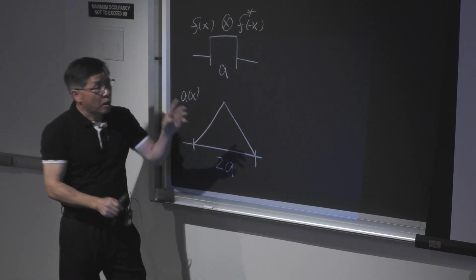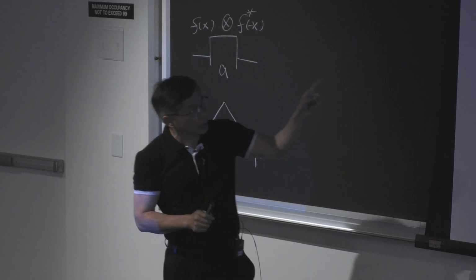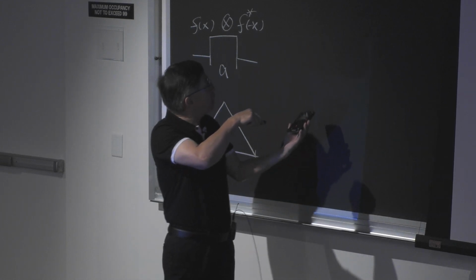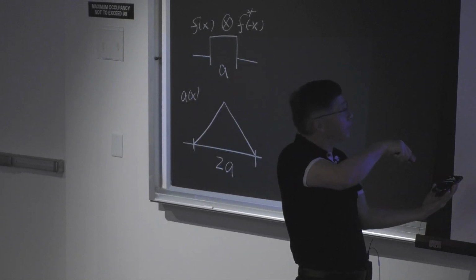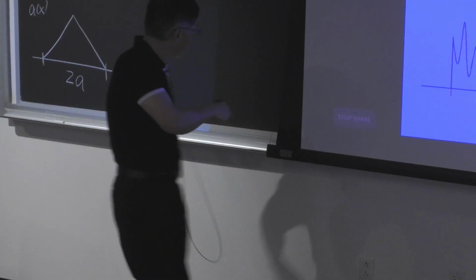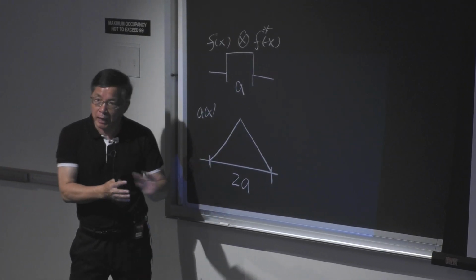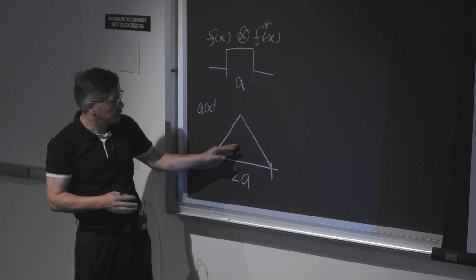Now, when you take a diffraction pattern, you shine the beam and this is the diffraction pattern. If you take an inverse Fourier transform of the diffraction pattern, that corresponds to the autocorrelation function. This was first realized by Patterson, and it is called the Patterson map.